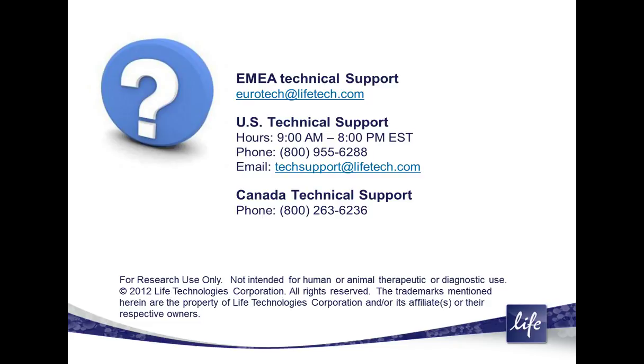With annexin V staining, there is a question about the ability to do intracellular staining. Annexin actually can be fixed. You would have to optimize your experiment very carefully if you wanted to do that. You have to be very careful in your washing steps and maintain a high calcium concentration for that.